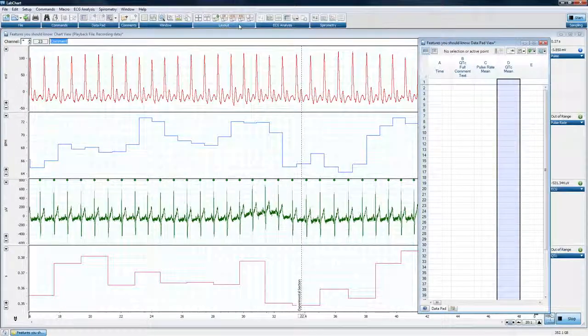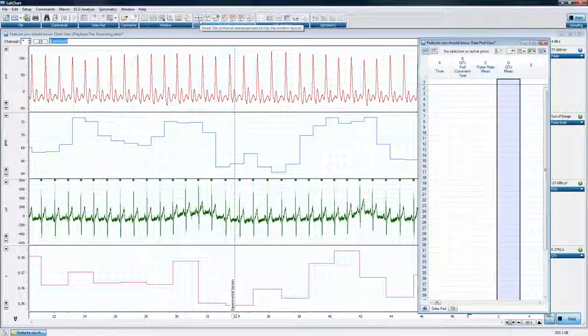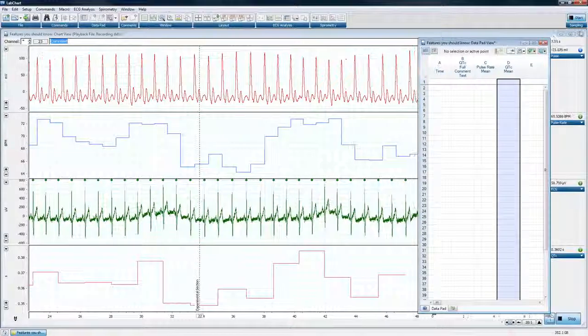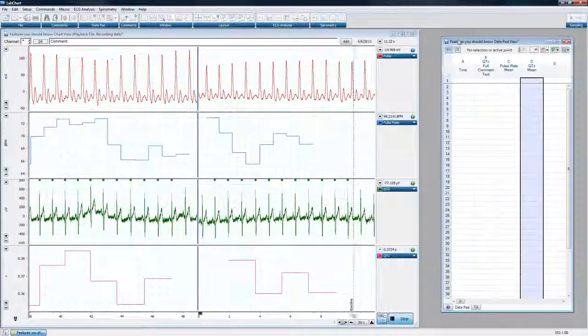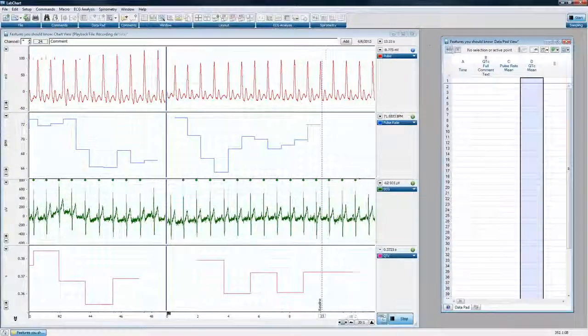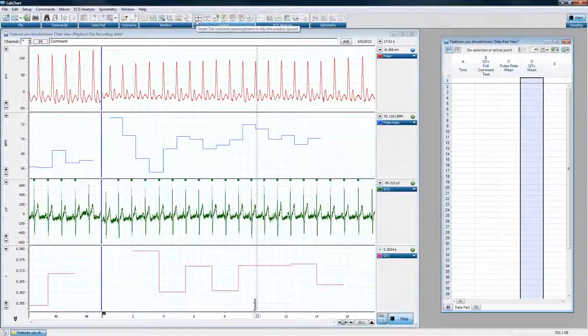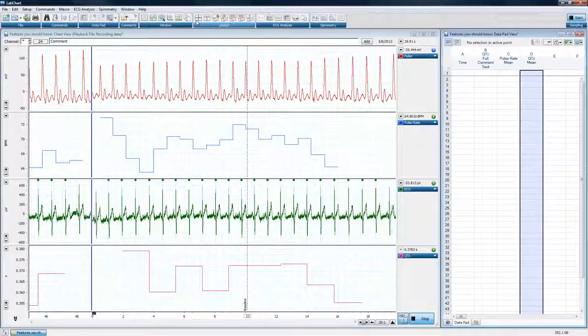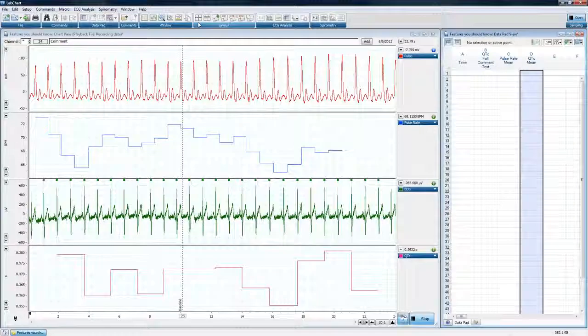One is I can use my Smart Tile feature. The Smart Tile feature is under the Layout toolbar. It's the first button, called Smart Tile. And the way that it works is you want to lay out your windows approximately how you'd want to see them. So by laying my windows out like this and then clicking the Smart Tile feature, it will automatically place them approximately the way they're already placed.